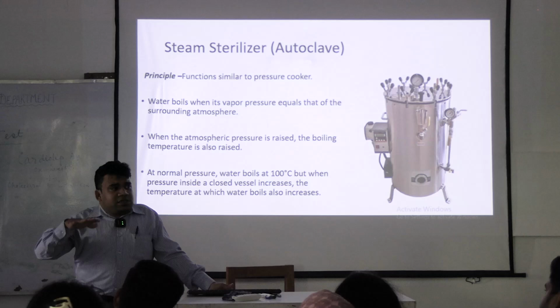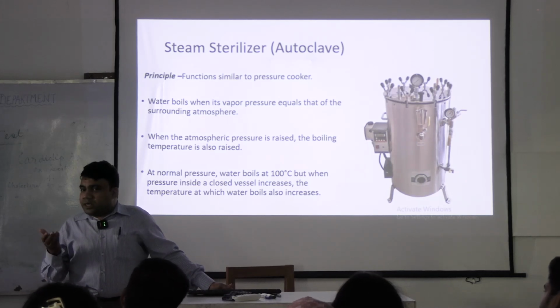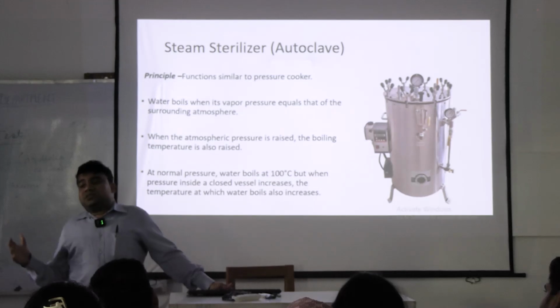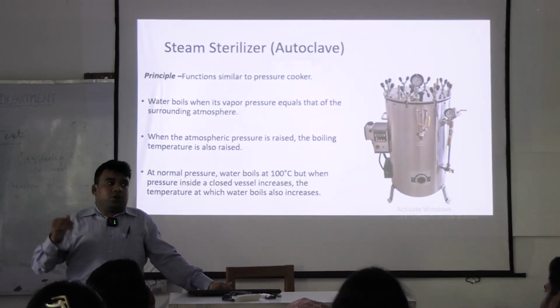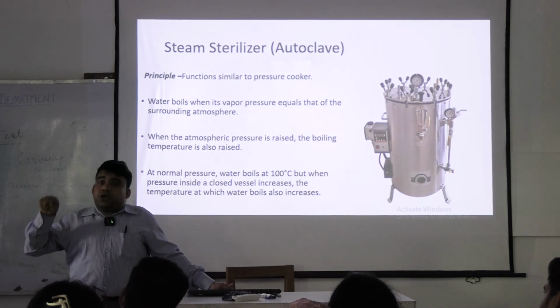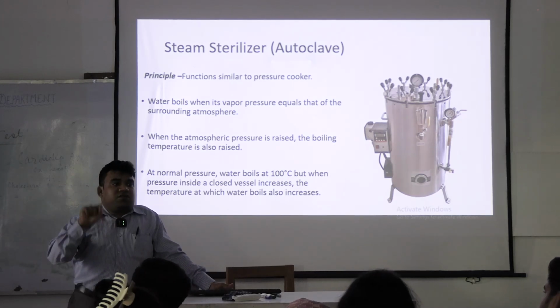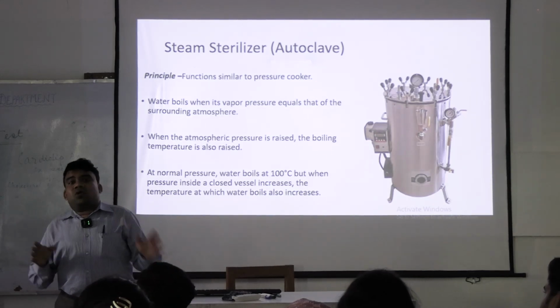Then you start increasing the pressure. Temperature starts to rise. When the pressure reaches about 15 pound, temperature will reach up to 121 degrees centigrade. When these two conditions are met, then we need to keep it for 15 minutes at that same temperature and pressure. That is the contact time.